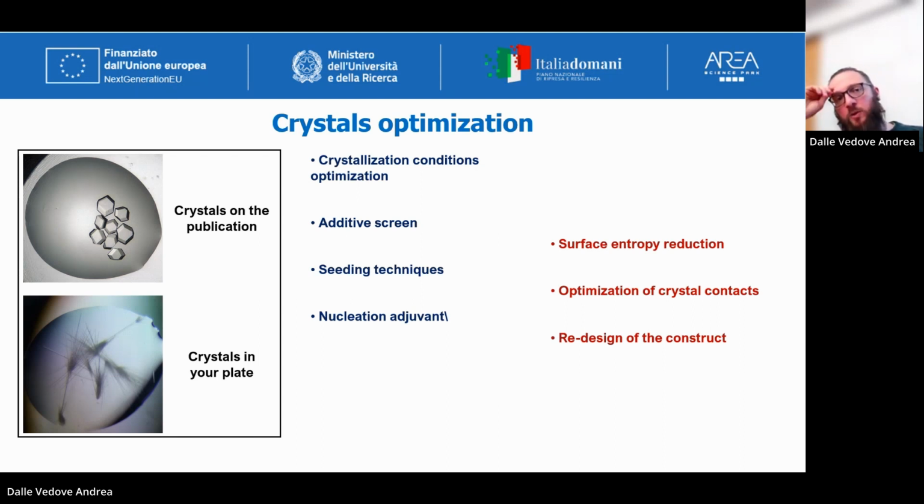And this means you have to start from square one, basically, and also redo all the purification and production process, sometimes re-optimizing everything. So they are available, of course, but you always hope not to be in the condition of having to use them.